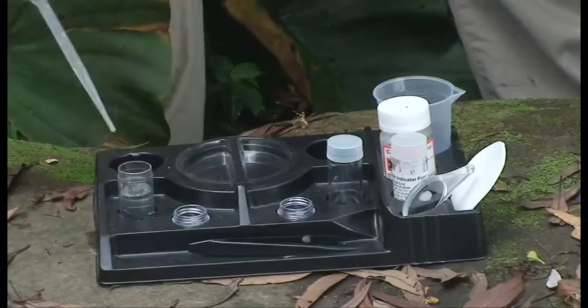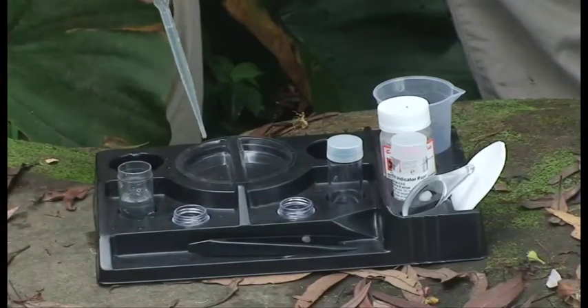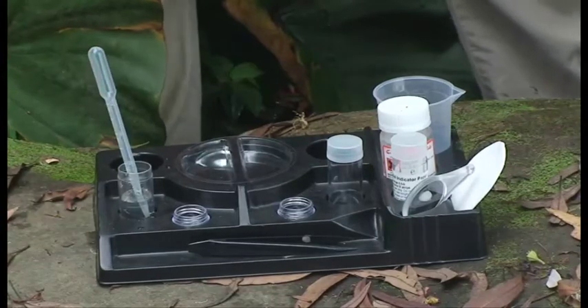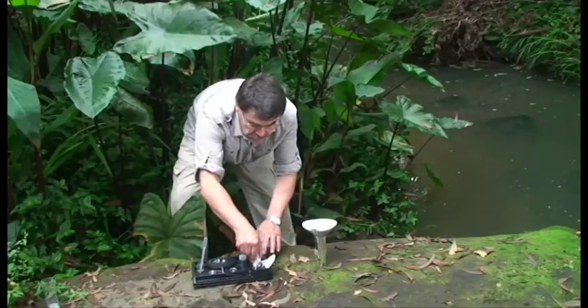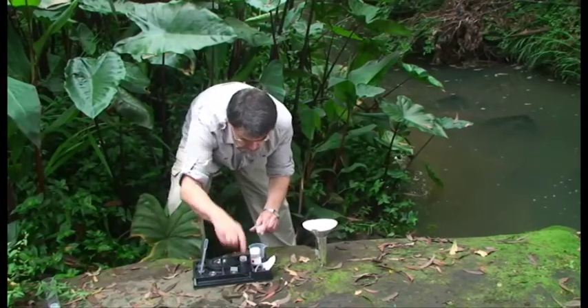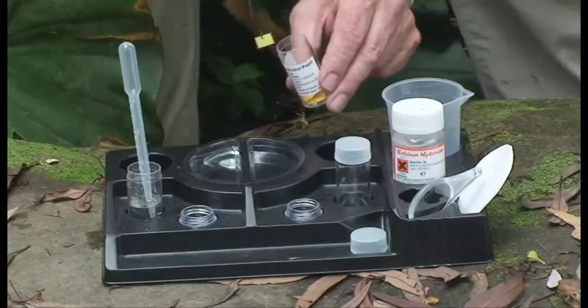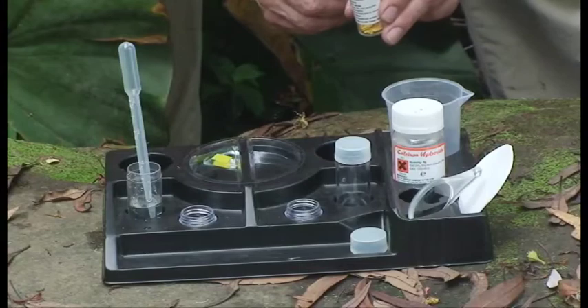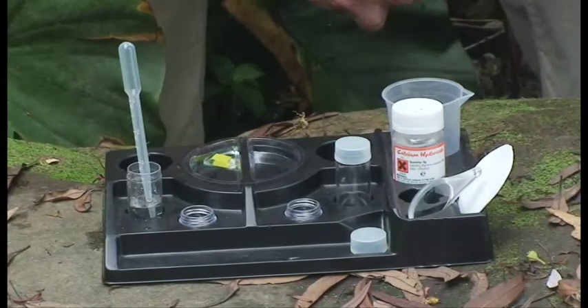Now I take 2ml of the water with our pipette and put it in the corner here like so. I get some pH paper and a pair of tweezers, and I take one piece. We leave it for 30 seconds for the colour to develop.